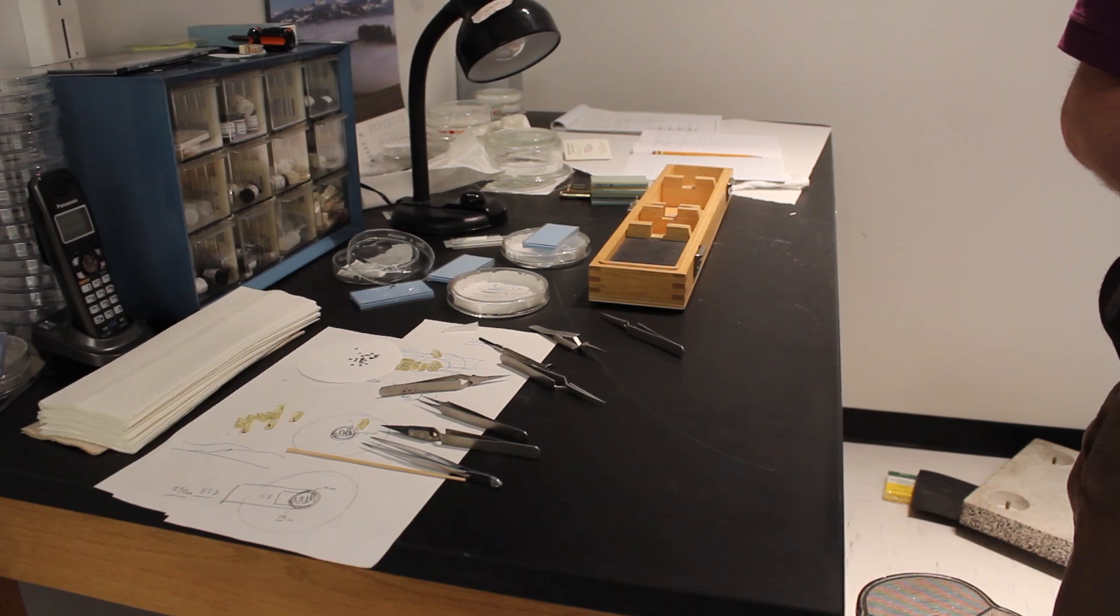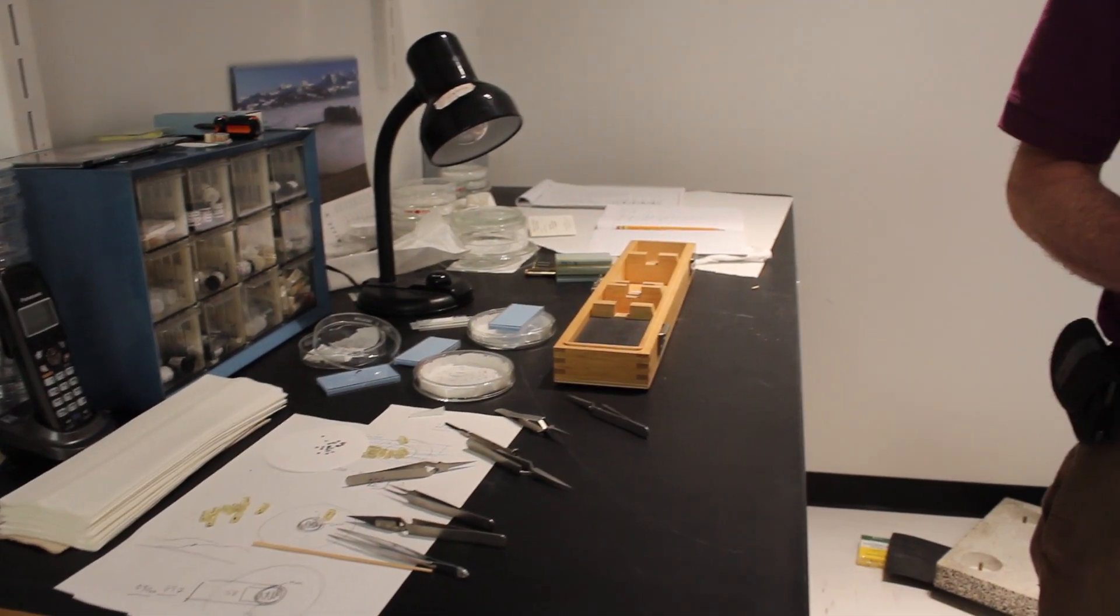This is a study from one of our faculty members who's working on drug discovery in cancer biology. Another big use for this microscope is looking at viruses. What they look like? Yep. Really?